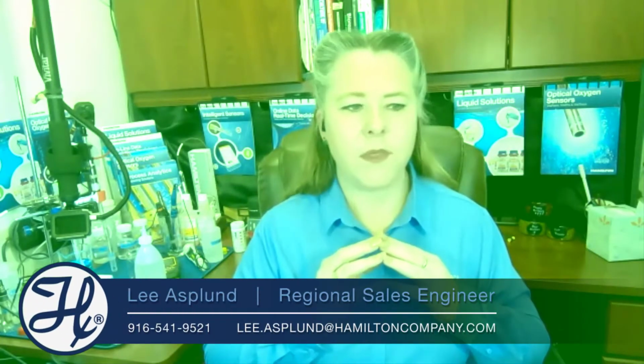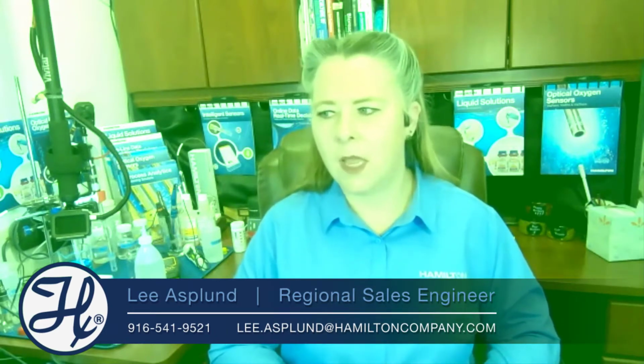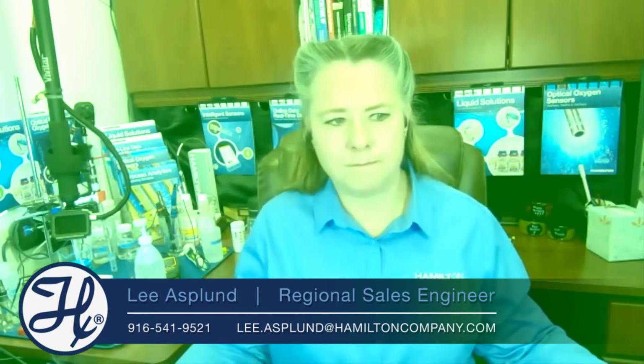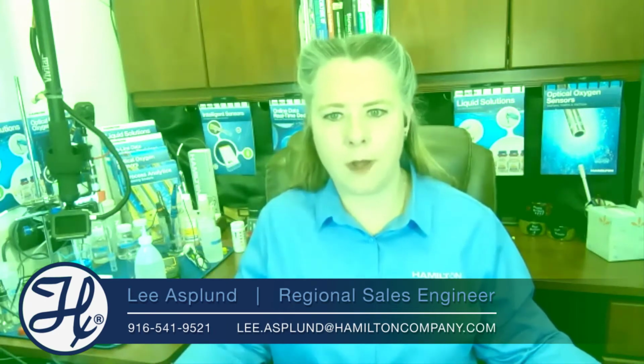That's the short of it, Mark: you have to have water in order to do a pH measurement. And I know that there are such things as organic acids, but unless there's water in there, they're not measurable with typical pH meters. So thankfully, in bioprocess, we're always in some sort of water environment.